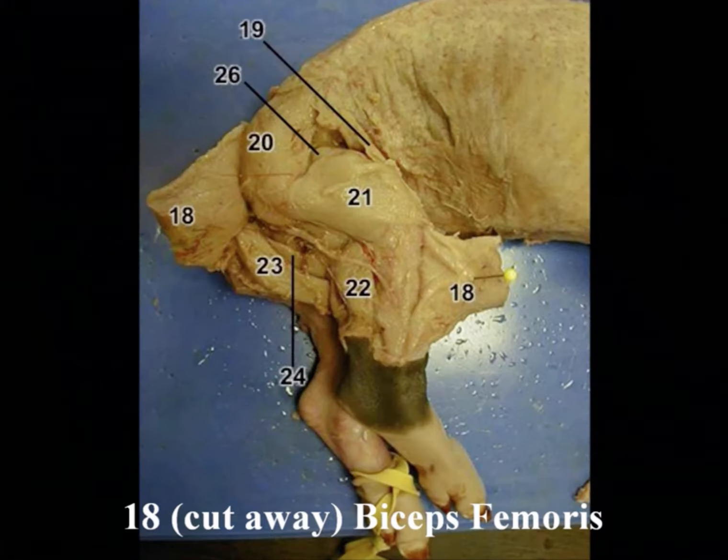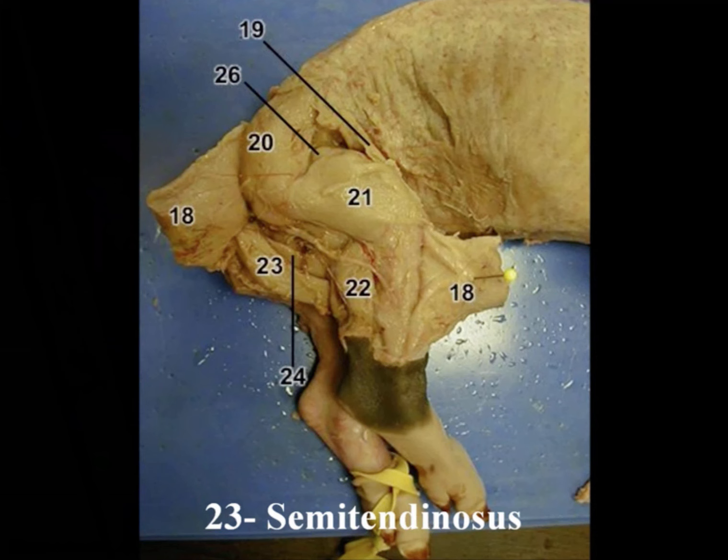So once again, a review: 18 here is the biceps femoris, but it's been cut away so that you can see 23, the semitendinosus. 24 is the semimembranosus, which is visible because you have cut away so much of the pig here. And 22 is the gastrocnemius. And 21 is the vastus lateralis.